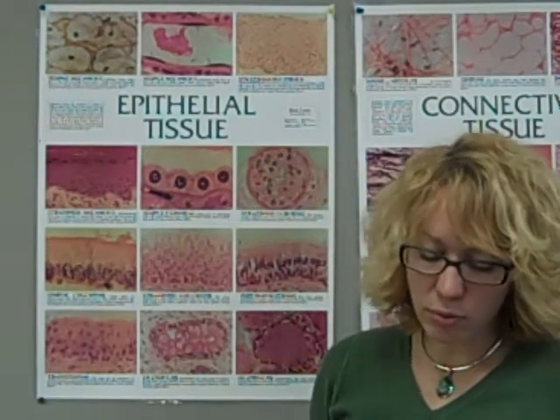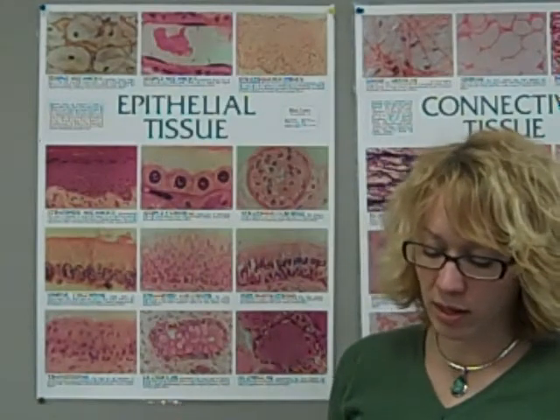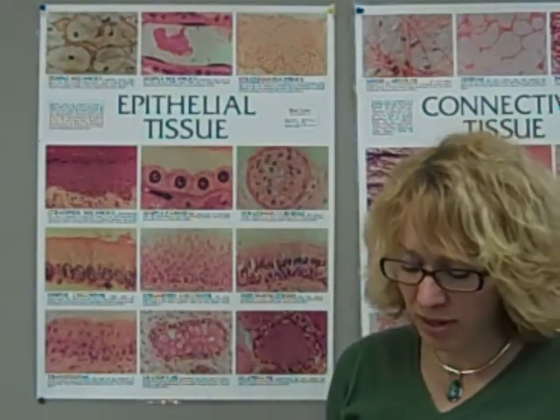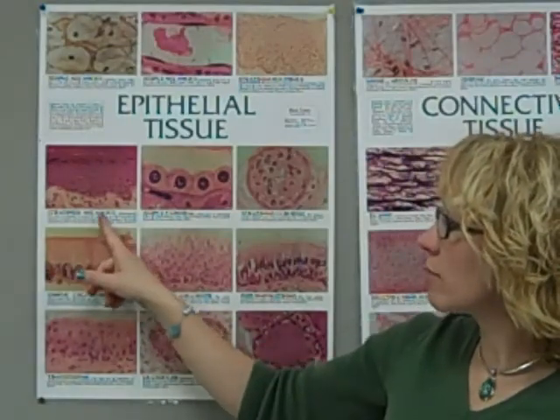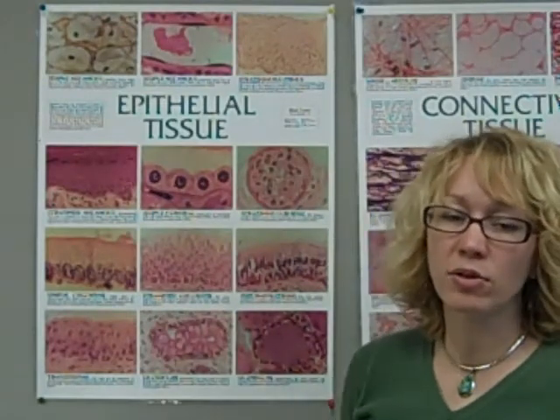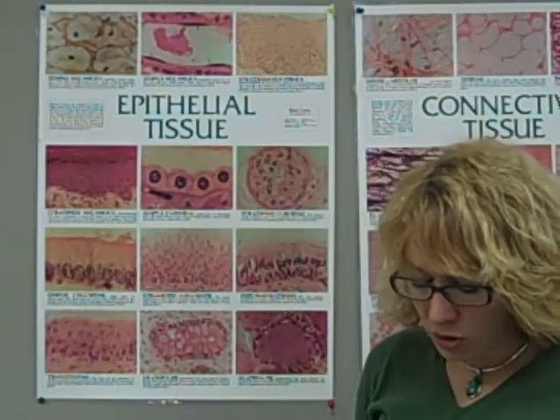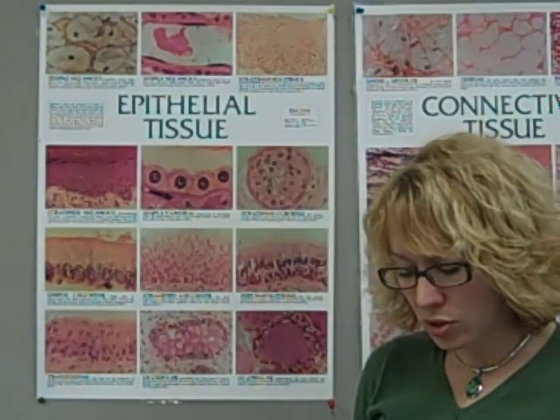Those are some of the ways that we can identify epithelial tissues. There are essentially 3 basic shapes. I mentioned cuboidal and columnar already. Those are 2 fairly easy to recognize shapes. The last one is called squamous, and it's pronounced squamous, squamous, whatever you like. Tomato, tomato, that's what I always say. That basically means flattened. There's no particular shape, it's flattened, it's irregular. In this image, it's stratified squamous, so multiple layers of flattened cells. That is what you find on the outside of your body. The skin, the integumentary system, has stratified squamous epithelium. So if you would take a few minutes and familiarize yourself with the variety of epithelial tissues that they have shown.